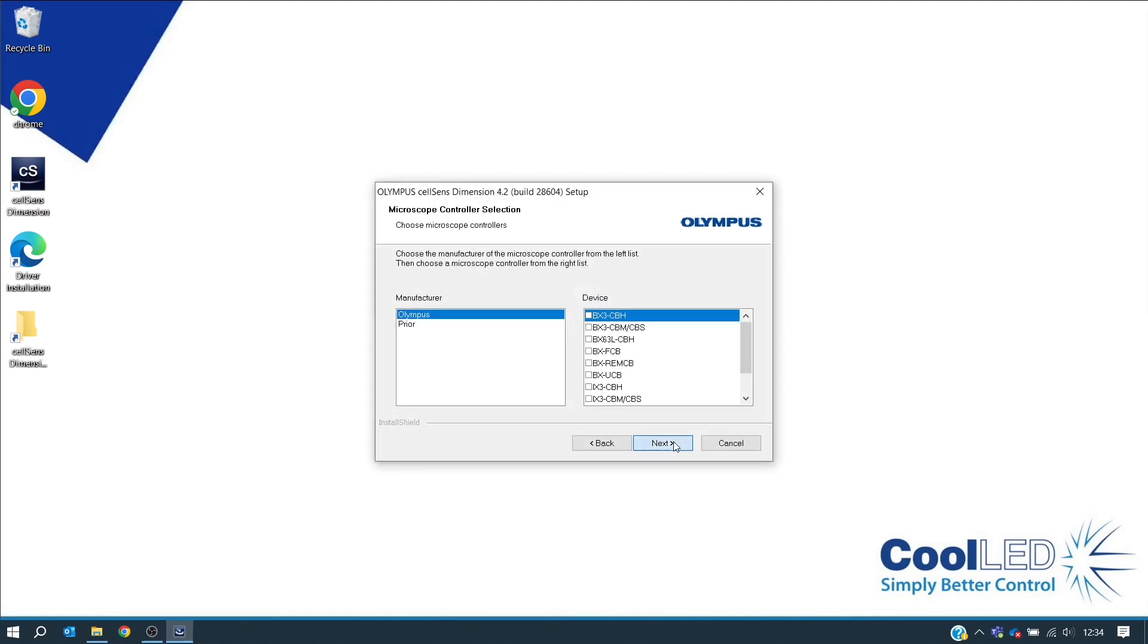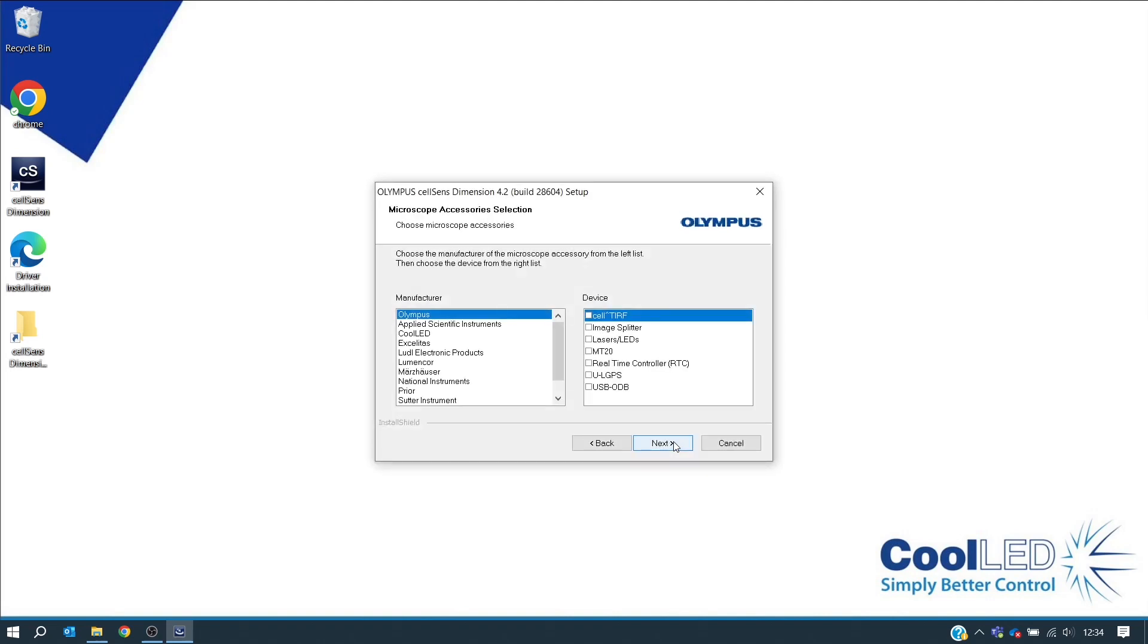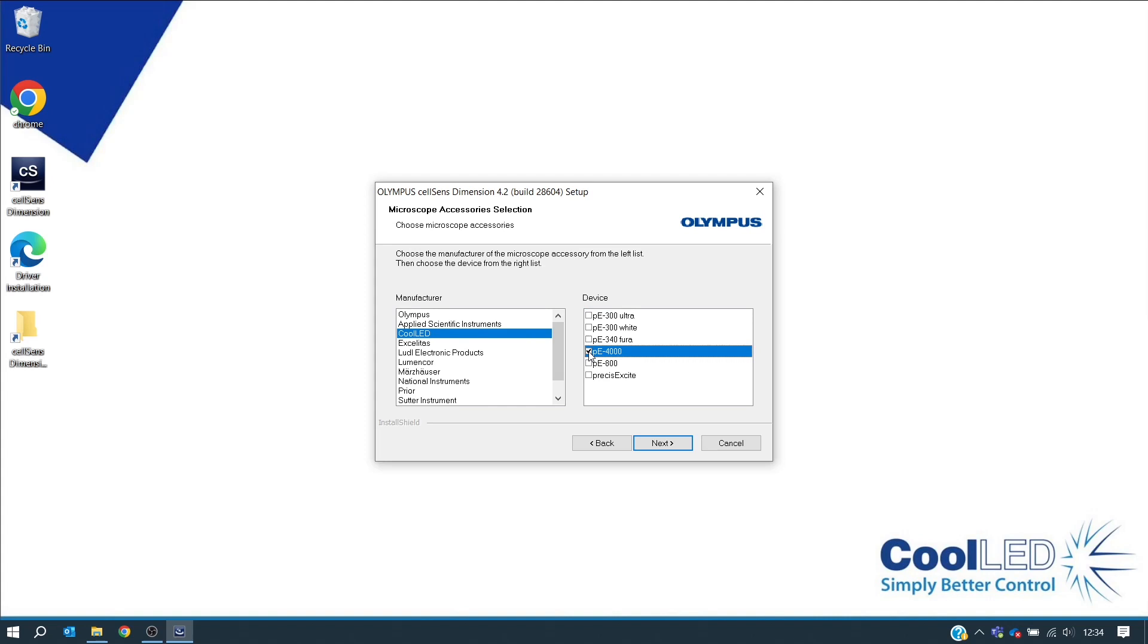And now you have reached the microscope accessories selection window. This is where you can select Cool-LED. We are selecting the PE4000 here, and you can also select any other illumination systems you require. We are selecting the PE800. Click Next.